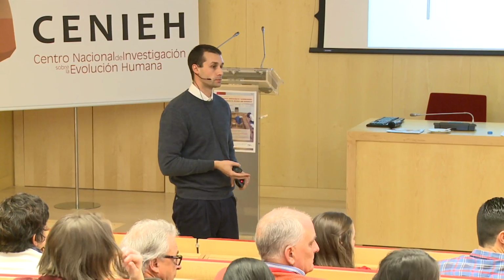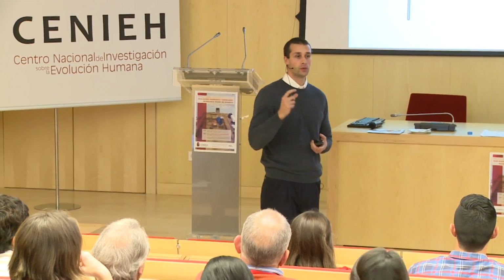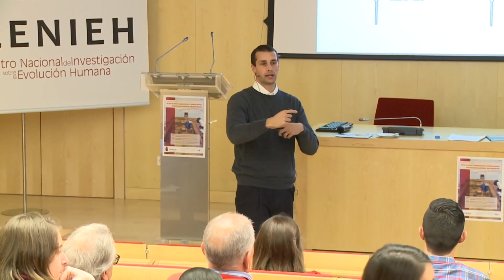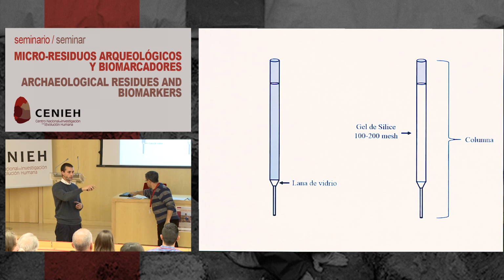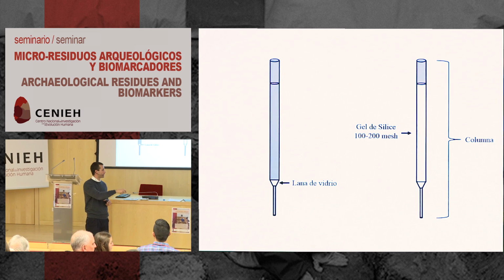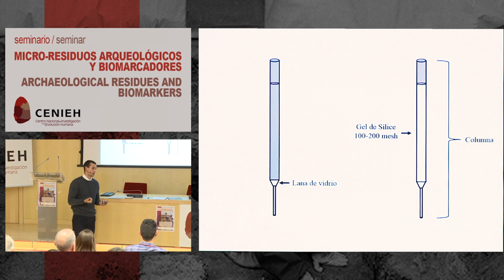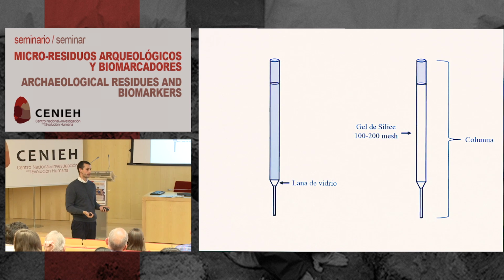How do you pack the wool? Yeah, so we have a 5-inch pipette, and then we use 9-inch pipettes. The 9-inch pipettes have a much longer tip at the end, so they fit perfectly right in here. So we just gently pack it down with a 9-inch pipette. If you have a metallic spoon or something else that can fit in there, it'll work exactly the same.